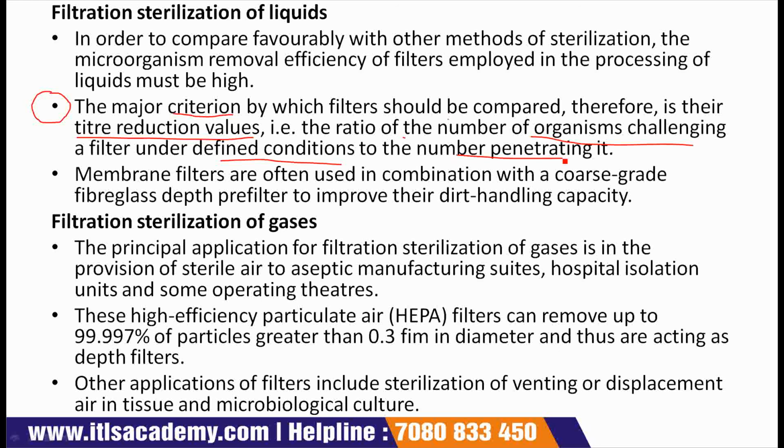Membrane filters in the form of disc can be assembled into pressure operated filter holders for syringe mounting and in-line use or vacuum filtration tower devices.